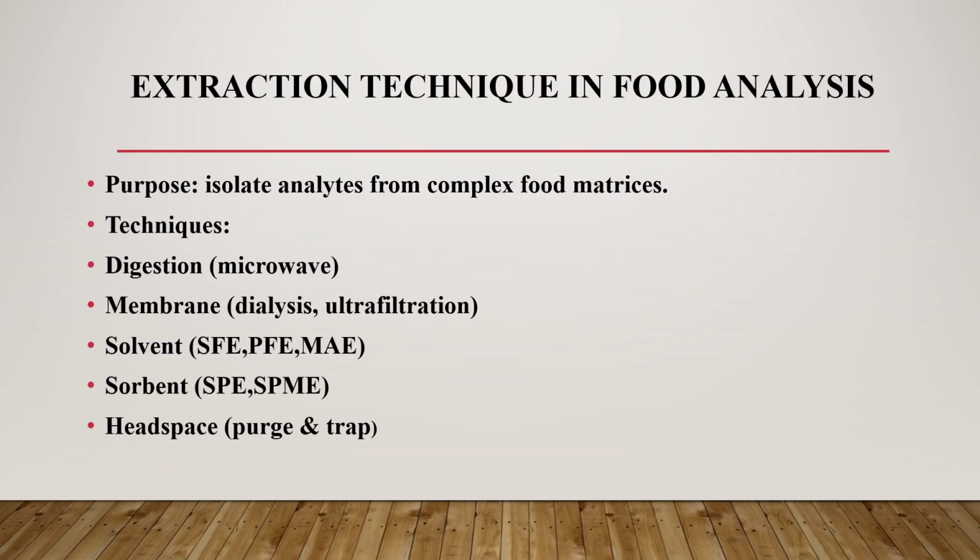Extraction techniques in food analysis. Food is a complex mixture, so we often need to extract specific compounds before analyzing them. The goal is to isolate the analyte, the substance we are interested in, from the rest of the food matrix. Here are key extraction methods.